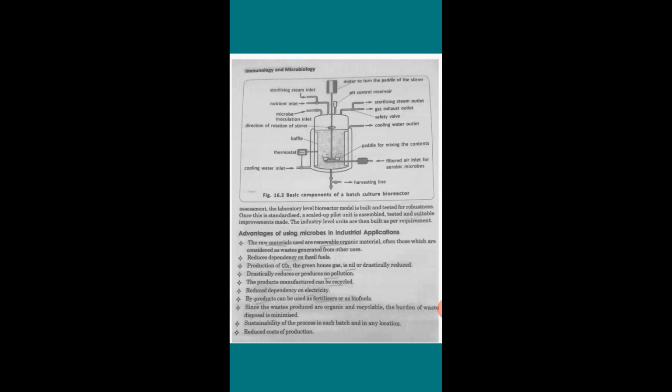Here you can see the thermostat, then the pH control reservoir.